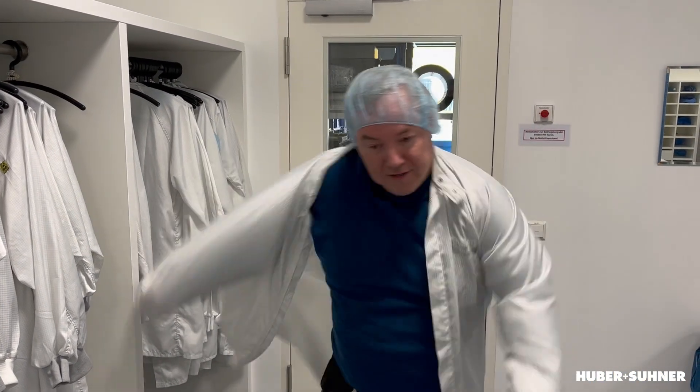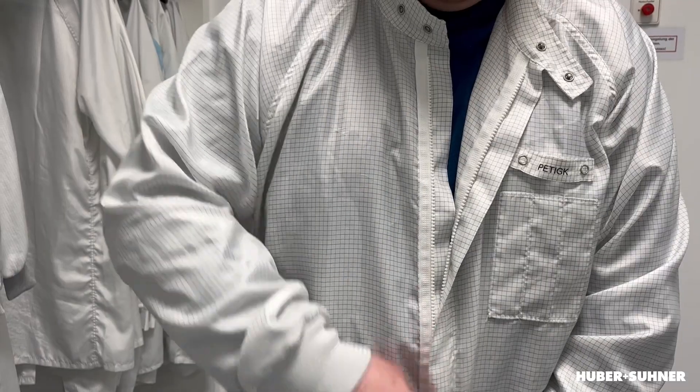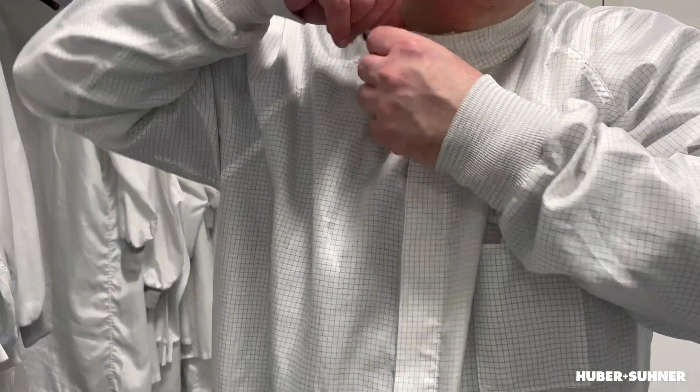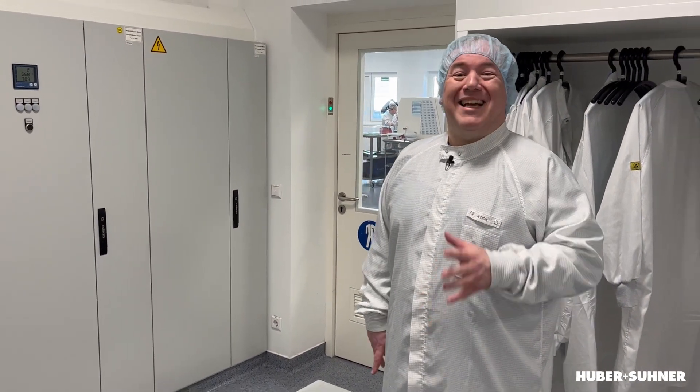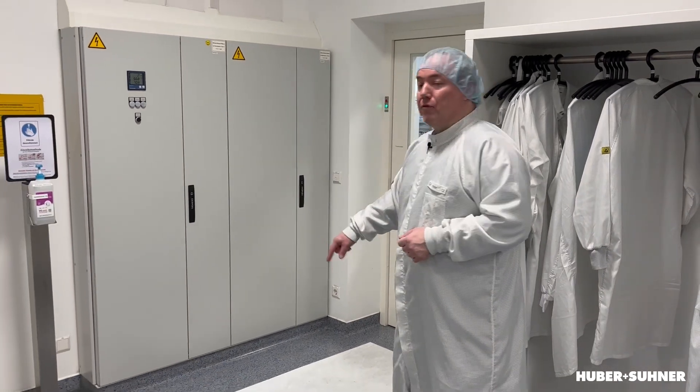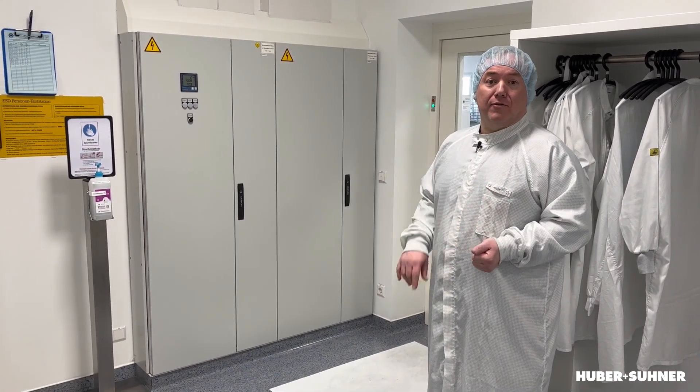Please take care to close the zipper up to the top. So now we can enter the clean room. Once again we have to push the button to unlock the door, but there's a last safety measure — it's the sticky tape on the floor. It removes the last particles from our shoes.